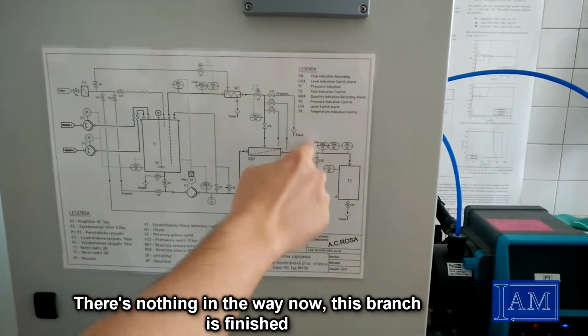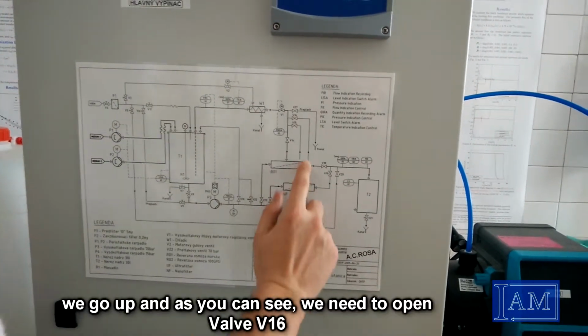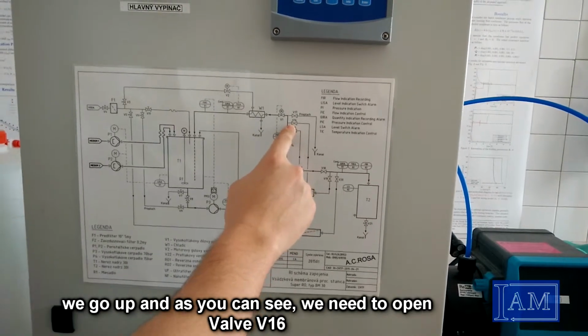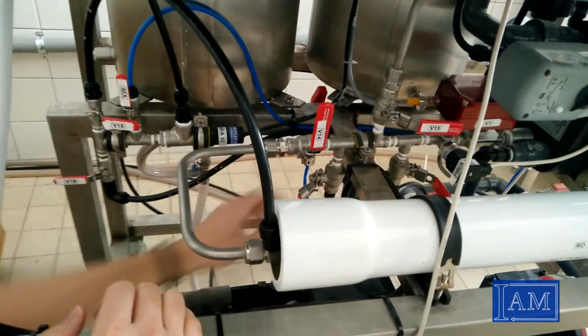We follow the second branch. We go up and as you can see, we need to open valve V16. So we open valve V16. After the valve is open, we continue.